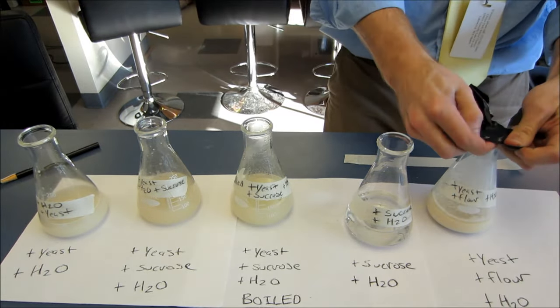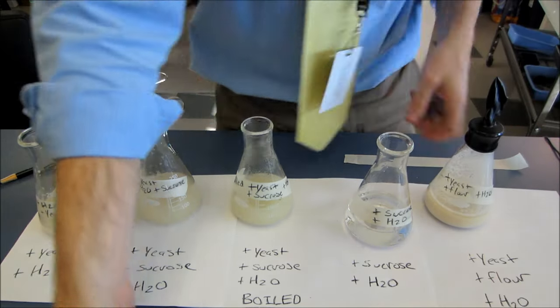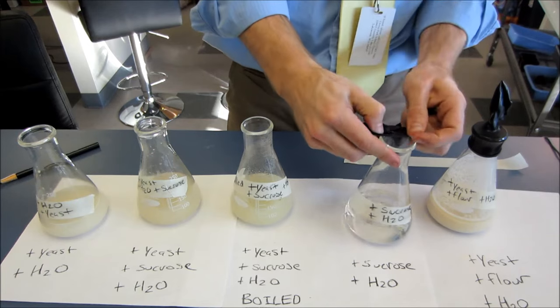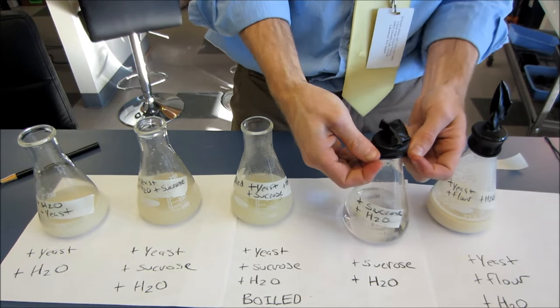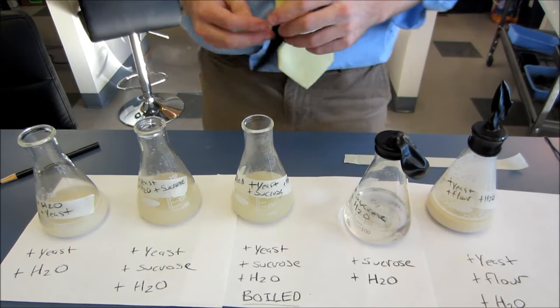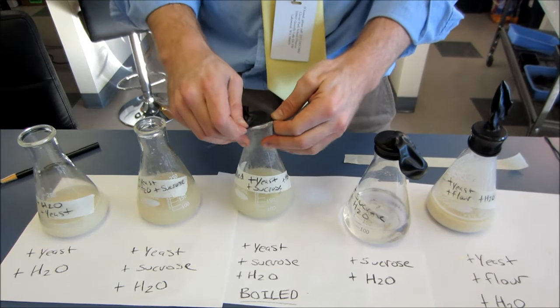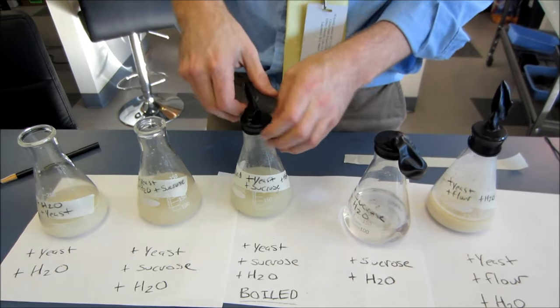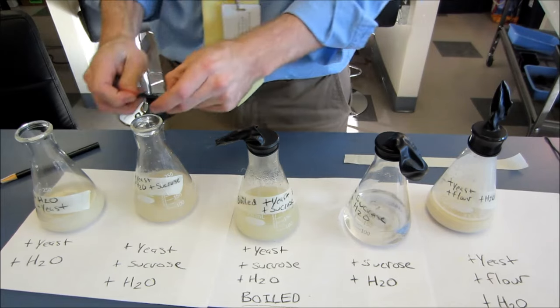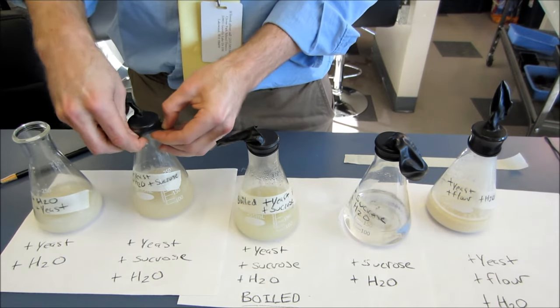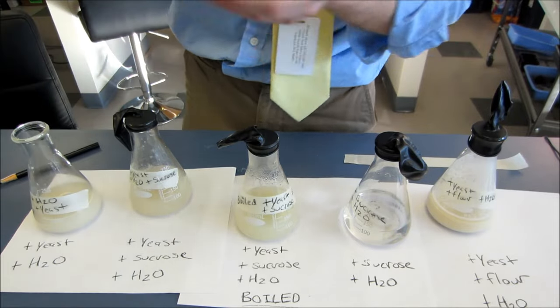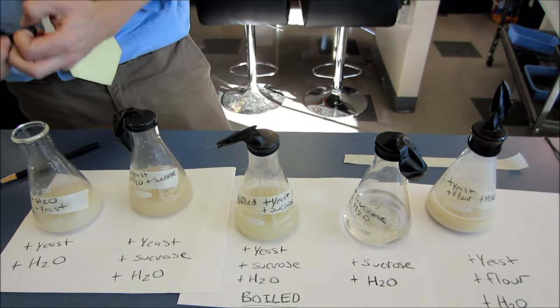If you're interested in doing this more quantitatively in a way that you can really count well, you could put maybe a carbon dioxide meter on top if you're lucky enough to have one of those, if your school has one of those. You could also just put on a gas pressure sensor. The higher the pressure inside the container, the more gas must be created inside the container. So therefore, you can surmise the higher the pressure, the more active the yeast are. There are many ways you can do this. We're just going to use balloons though. I like balloons because they're easy and visual.